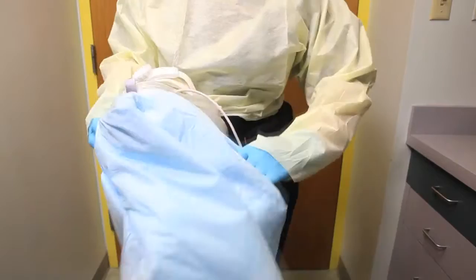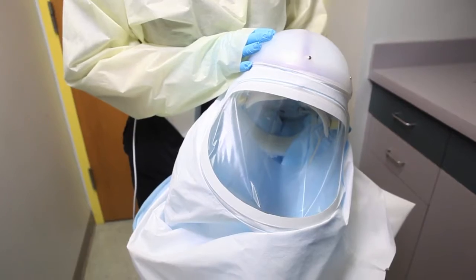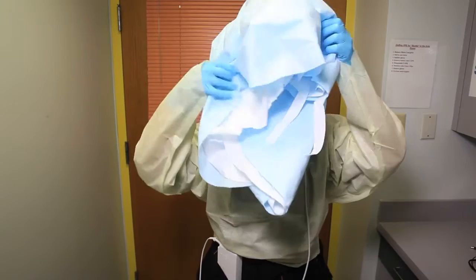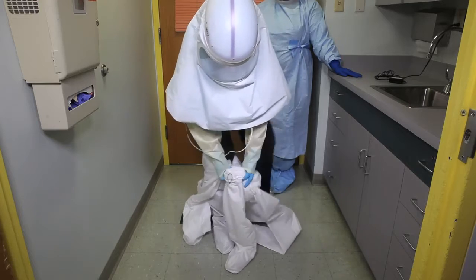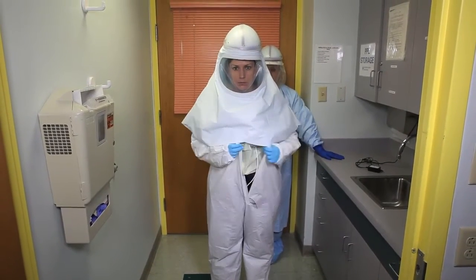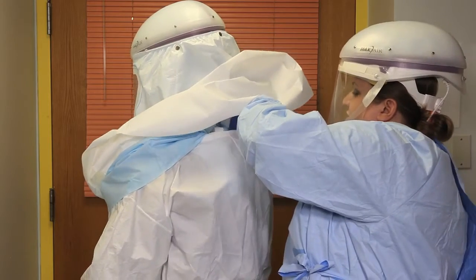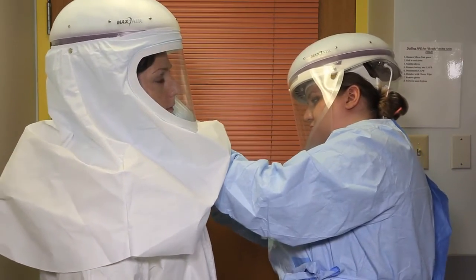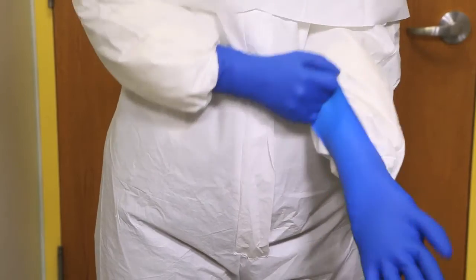Attach shroud to capper. Don capper with shroud attached. Don jumpsuit. Buddy will tuck the blue layer of the shroud into the jumpsuit, then zip the jumpsuit. Don extended cuff gloves. Be sure to tuck the cuffs of the jumpsuit into the gloves.